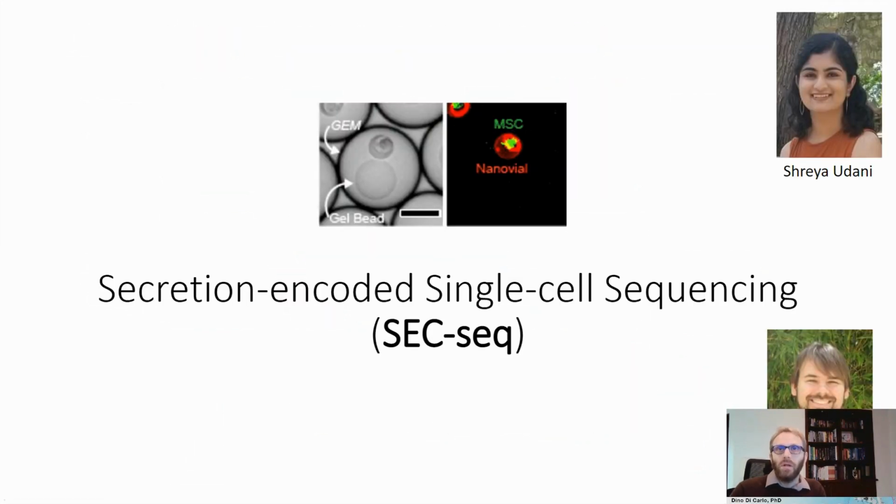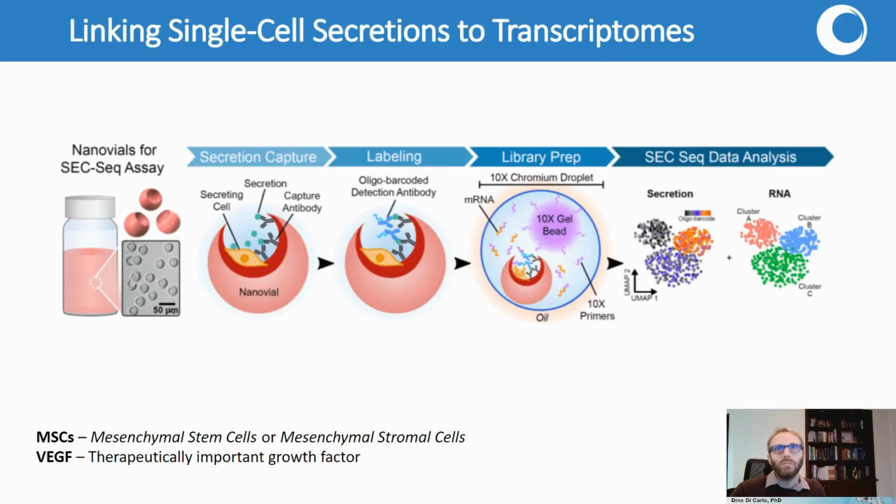So let me introduce this concept of secretion-encoded single-cell sequencing, or SEC-seq. This is led by my student Shreya Udani, along with Justin Langerman from Catherine Plath's lab here at UCLA. And they've done an amazing job to develop this new approach to link transcriptomes and secretions from single cells.